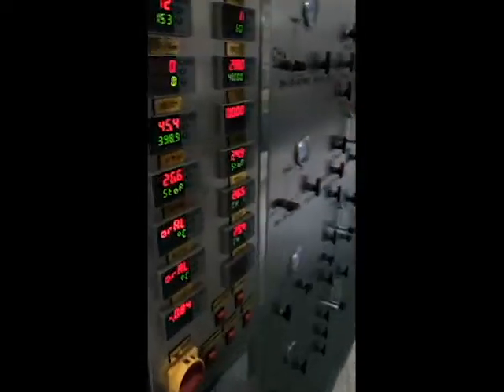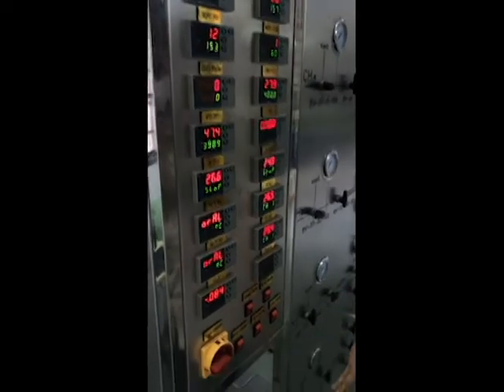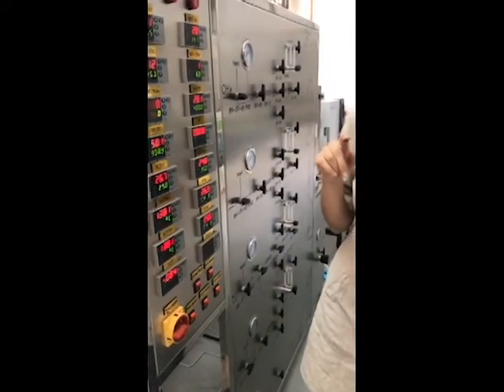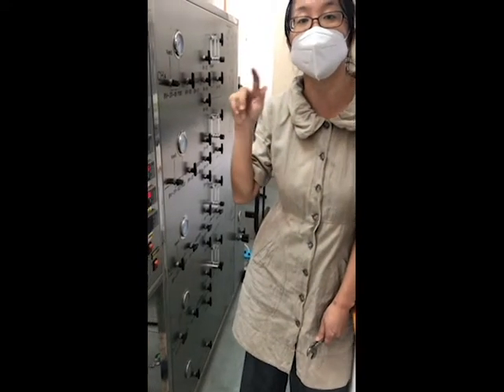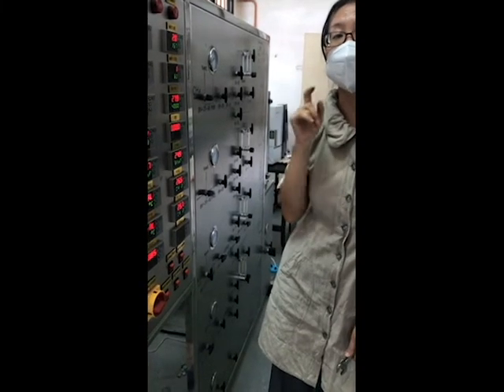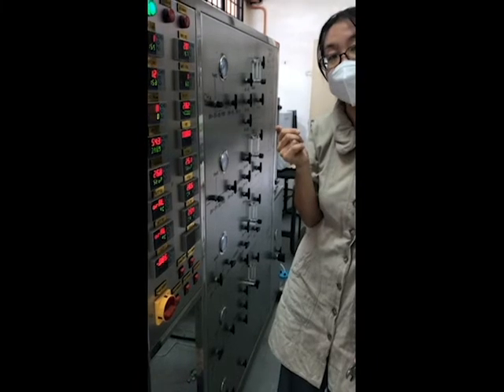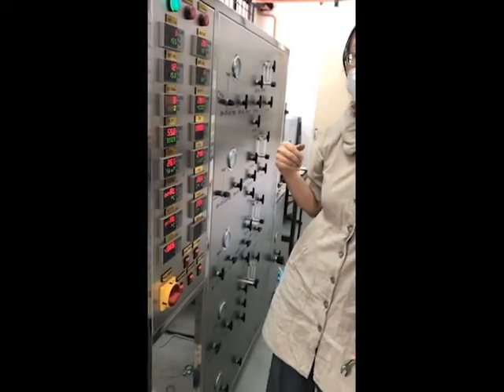If you ask why two reactors are used: because it was initially designed for this reaction, when we conduct steam reforming, we can then do a water-gas shift. After that, we can convert the carbon monoxide into carbon dioxide. So we can make sure the gas is full of hydrogen and carbon dioxide. Because it was initially designed for using methane and steam to produce hydrogen, we want the final gas product without carbon monoxide, because carbon dioxide is much easier to remove. After we remove the carbon dioxide, we obtain pure hydrogen. So after the steam reforming, we follow with the water-gas shift. There are two reactors.